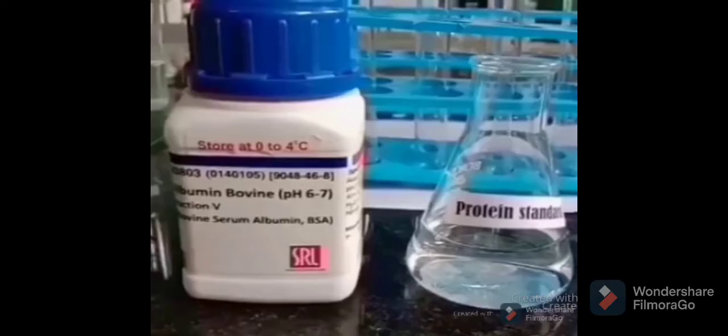In quantitative assays, a standard is needed. Here, protein BSA of 25 milligram in 100 ml 0.1 normal NaOH is used. The standard is needed to assay unknown concentrations of protein solutions and is used to make serial dilutions of standards.